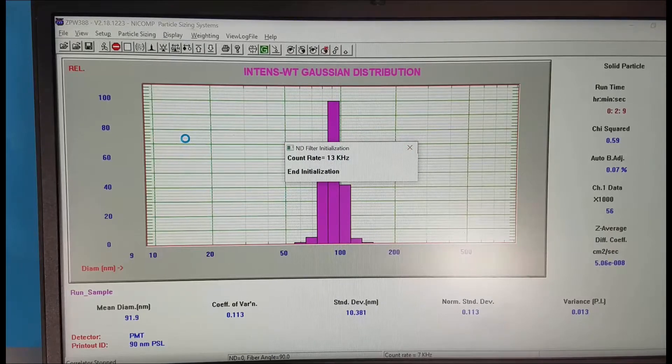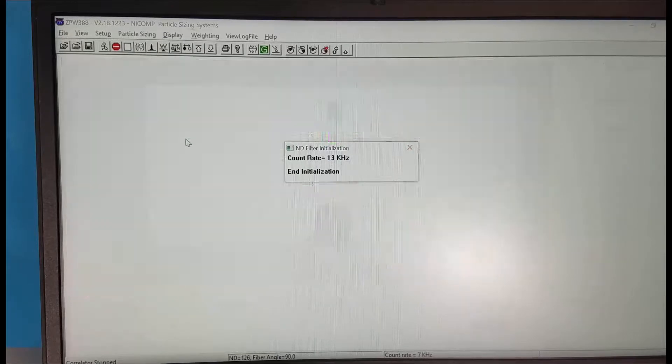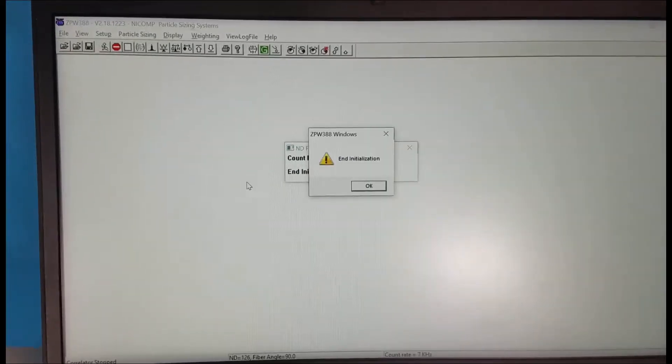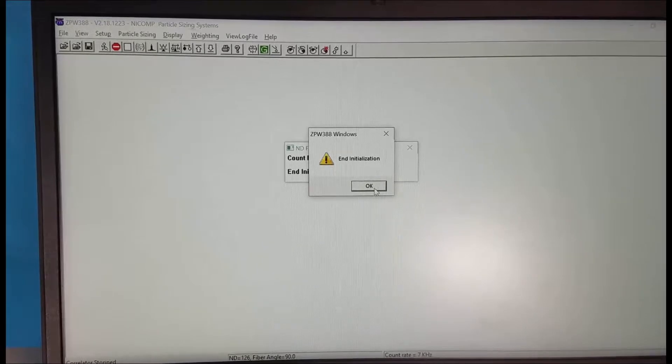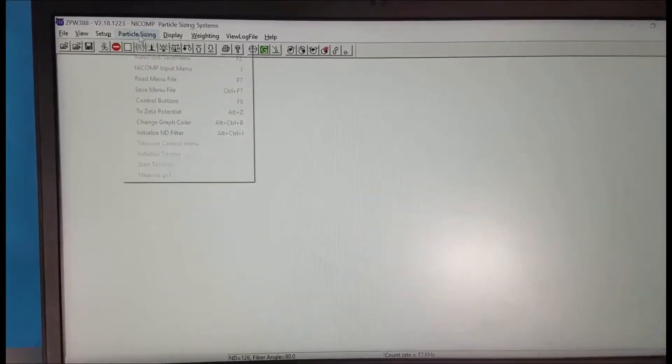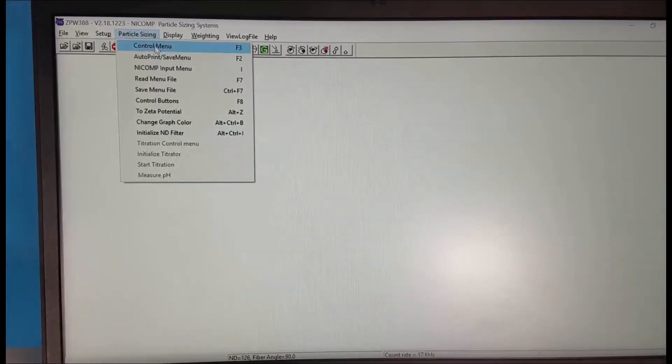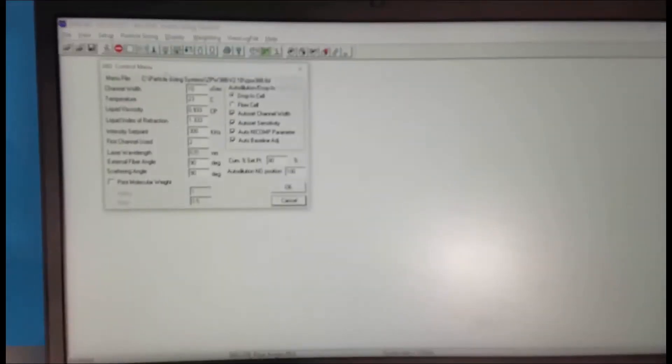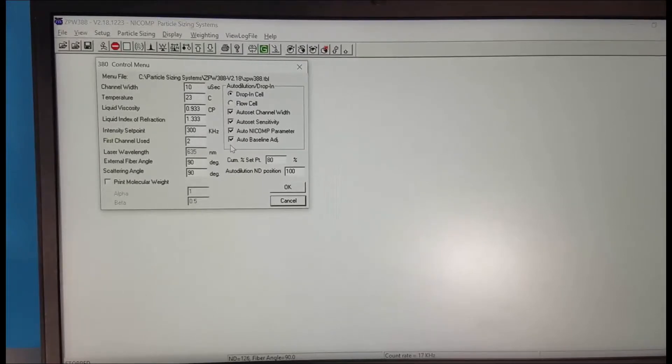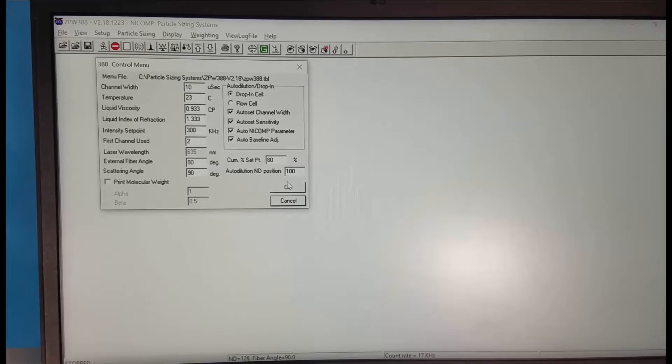When it's completed we click OK and then we have two screens to set up. Particle size control menu. Here we make the settings as described in the slide. This all looks like it's fine.